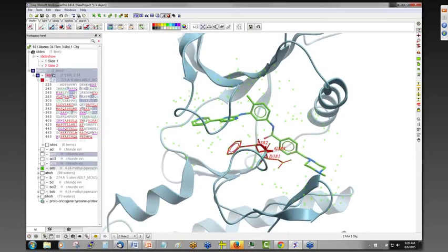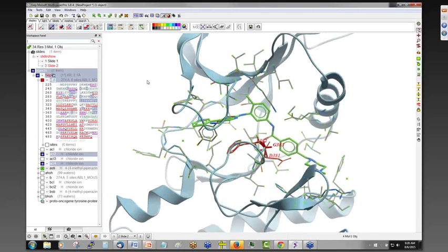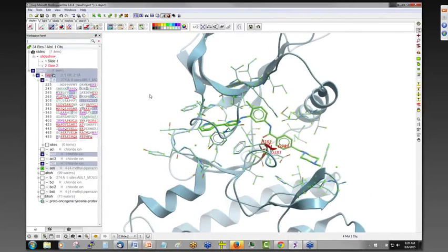You can see exactly which residues are selected in the sequence here as well. And there's a button here which says R. So this propagates. So if you make a 6 angstrom selection, you may not select every single atom of the residue. So if you want to display the whole side chains, you can propagate that selection to all atoms of the residues you selected. And so we have all the side chains here. And we can color the side chains by molecule carbon. So you can see they're the same color as the ribbon.